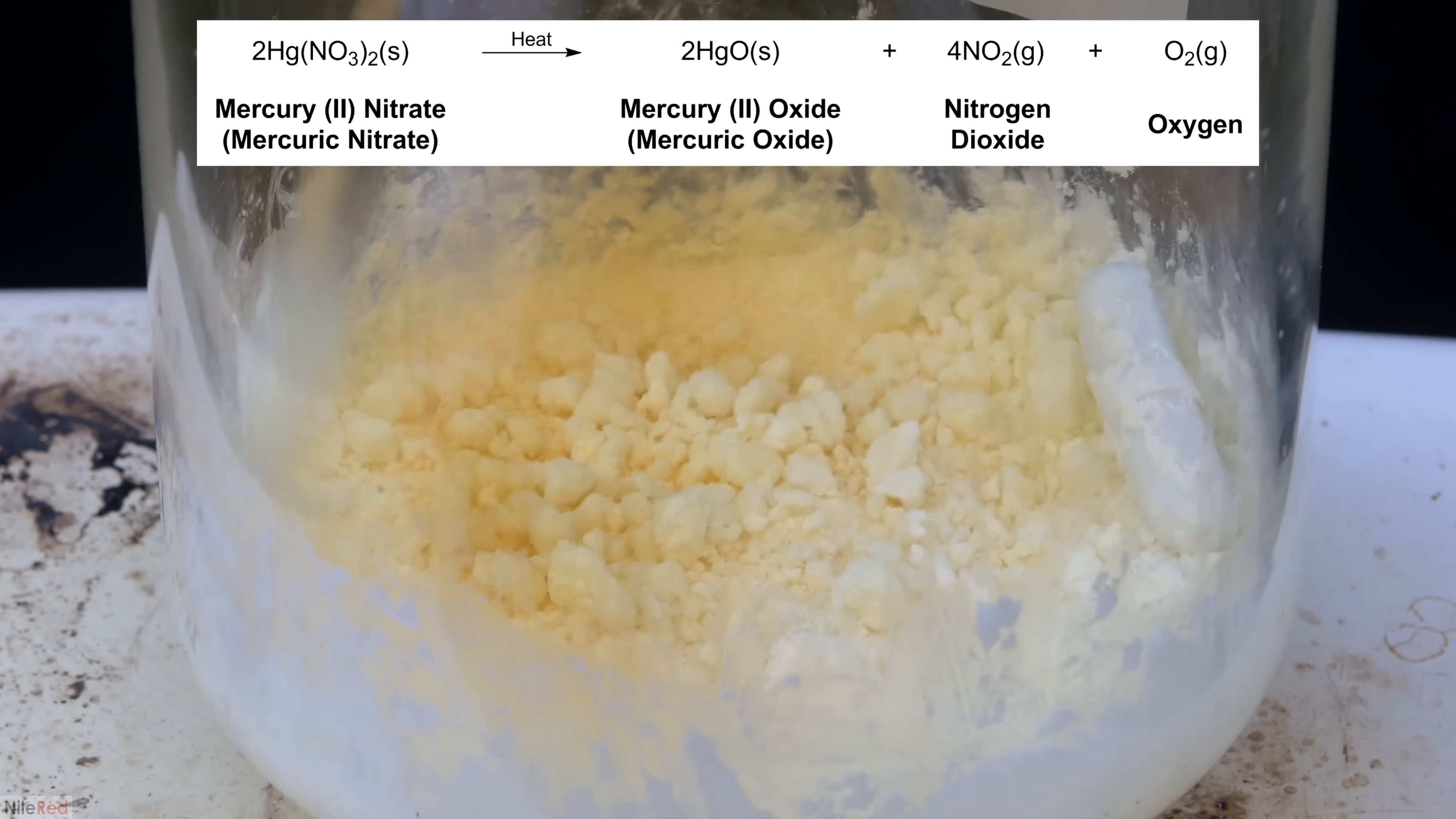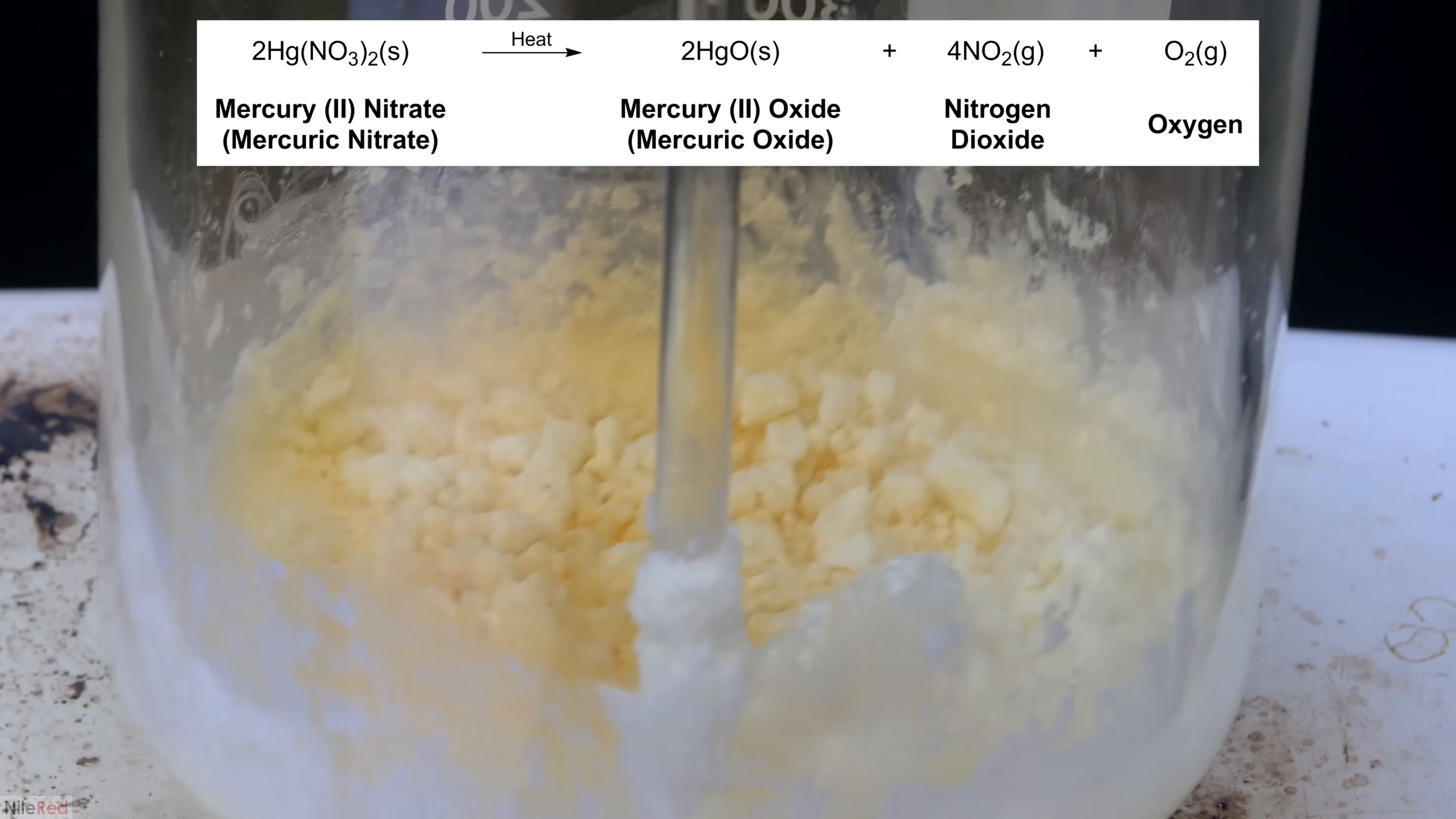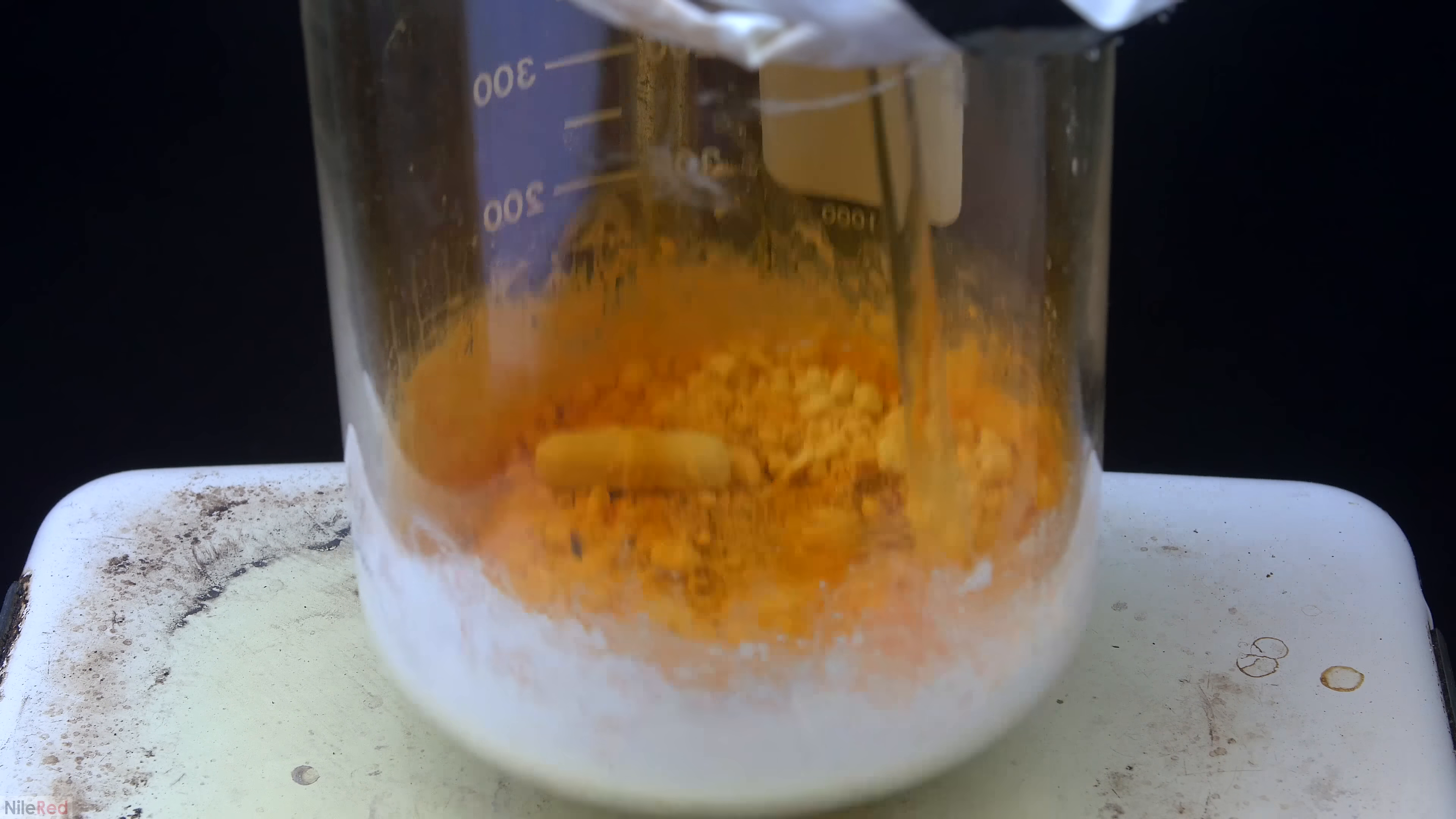So as I said before, we're decomposing our mercury(II) nitrate into mercury(II) oxide, but we also form a little bit of oxygen gas, as well as nitrogen dioxide. As the mercury(II) nitrate continues to decompose, we start to see some red mercury(II) oxide forming.